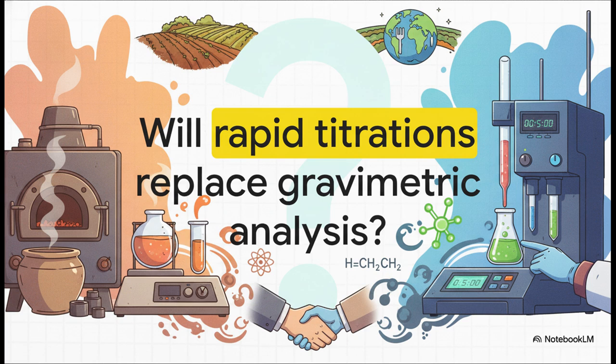As global agricultural demands continue to skyrocket, testing laboratories are under immense constant pressure to deliver faster results. Will the slow, historic precision of gravimetric analysis, with its heavy ovens, specialized crucibles, and overnight settling, eventually be entirely replaced by these rapid 5-minute thermometric titrations? It's a truly fascinating balance between traditional rigor and modern efficiency, sparked by Dr. Kem's incredibly detailed look into agricultural chemistry.